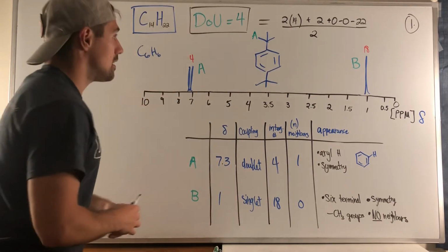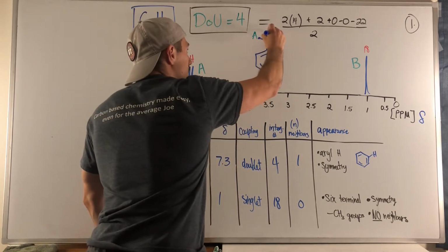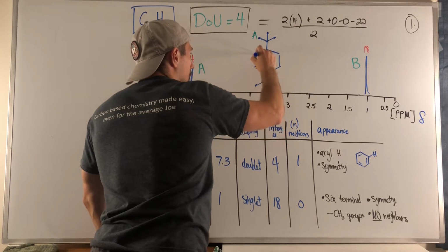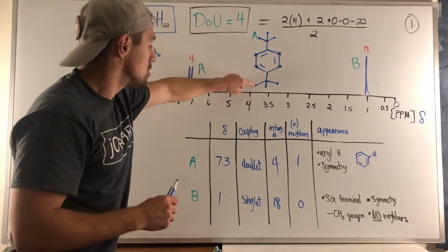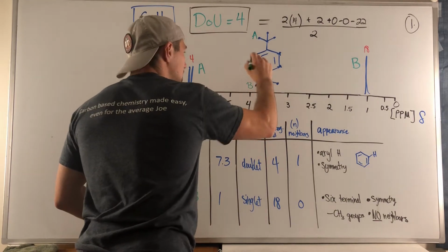What I just did was also make sure that these are all equivalent positions. Here, I'll dot them. And I will asterisk what are all equivalent positions right here. So I just made this position equivalent as well. So B is taken care of. But did I also just take care of A? And the answer is yes.